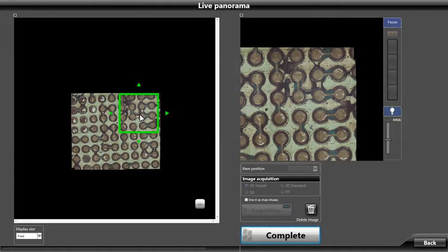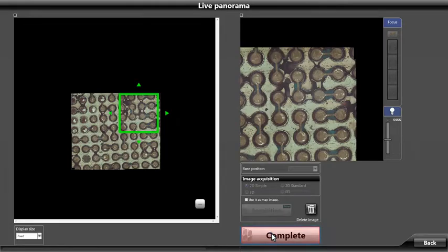Once we have completed scanning the area of interest on the sample, we click on complete.